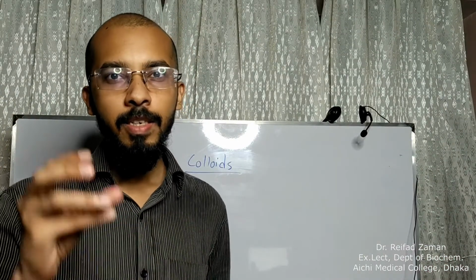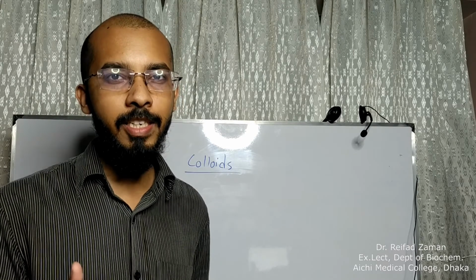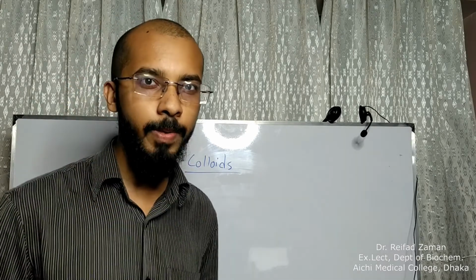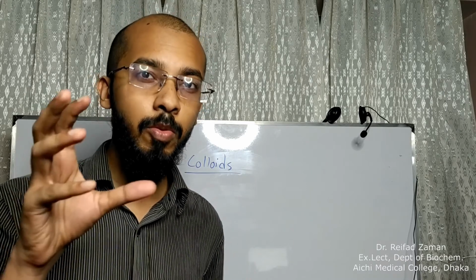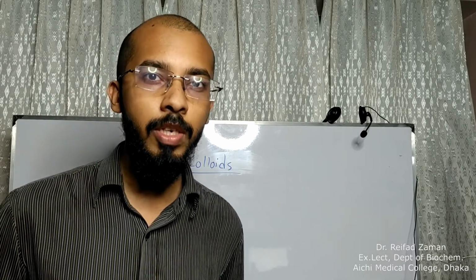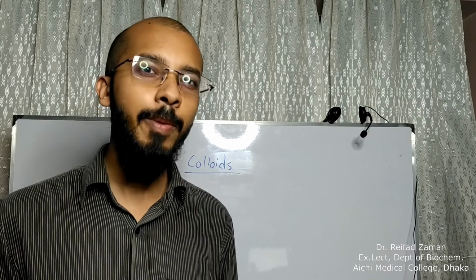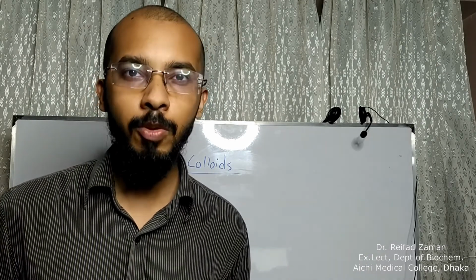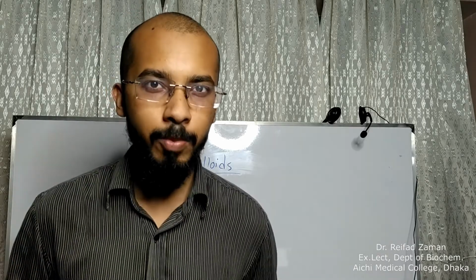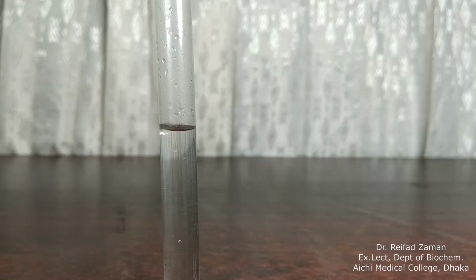Colloid এর বেলায় ওদের যে solutes এর size এটা crystalloid এর চাইতে বড় হবে. Colloids do dissolve in the solution, but যেহেতু ওদের particle sizeটা বড়, so অনেক সময় ওরা ফিল্টার পেপার দিয়ে পাস করতে পারলেও dialysis membrane দিয়ে পাস করতে পারে না. So let's make some colloids. So for this last experiment we are going to make some colloids.